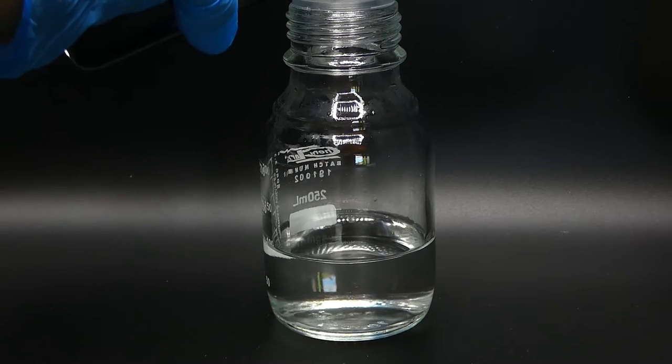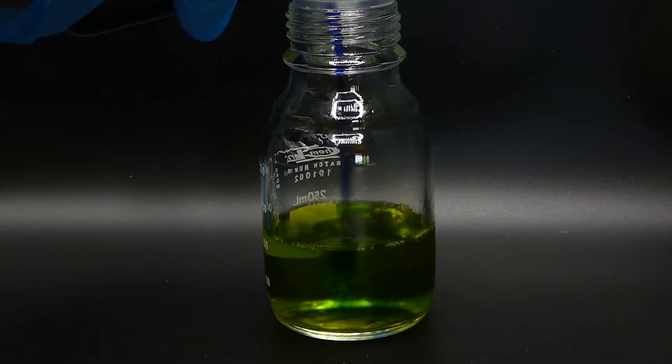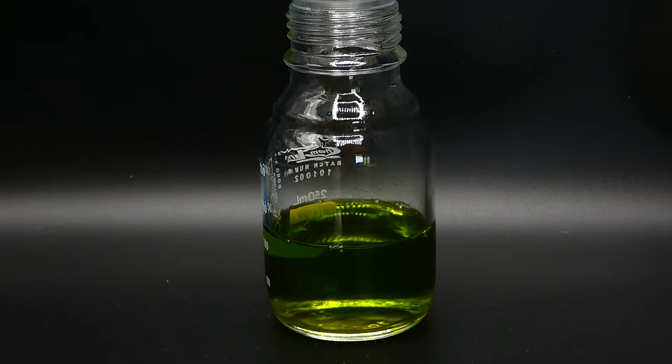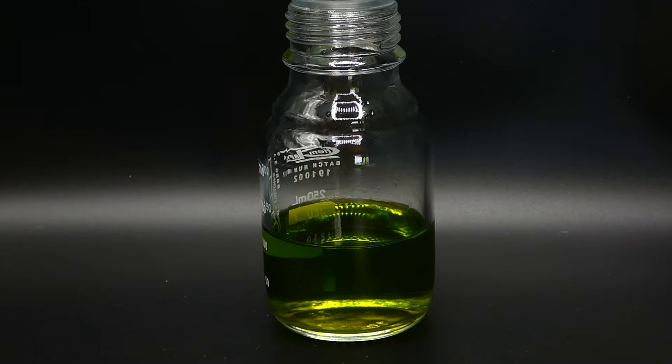The demonstration which you might have watched in your school is usually prepared by first mixing three solutions together, waiting a bit, and then watching the mixture magically change color upon being shaken.